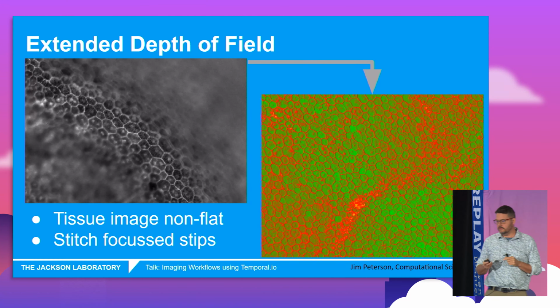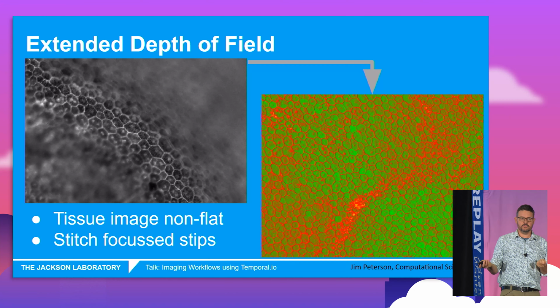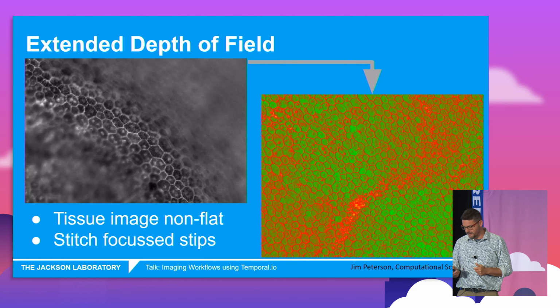So what this tool is then doing is looking at that stack, processing them all, and then adding them up into one in-focus image. That's pretty cool, and it's pretty useful for researchers who just want to get a feel for their sample in a single image. It doesn't colorize it. It also works with color, so I actually have a color result and a gray. But if you put in a stack of images, you get a gray result.